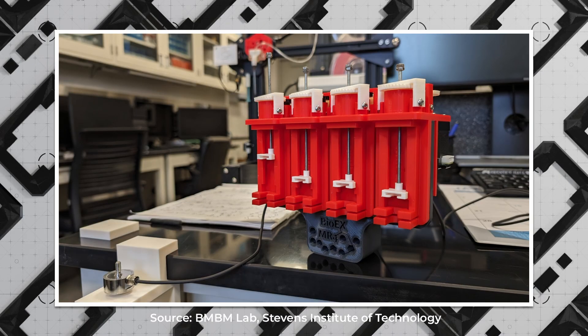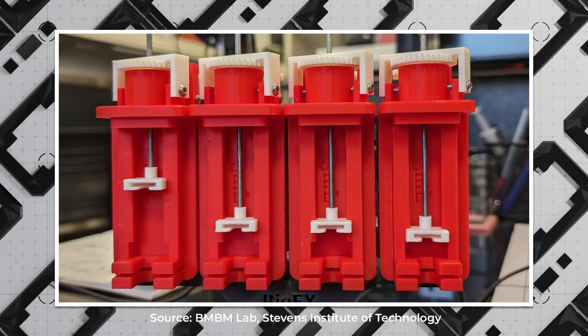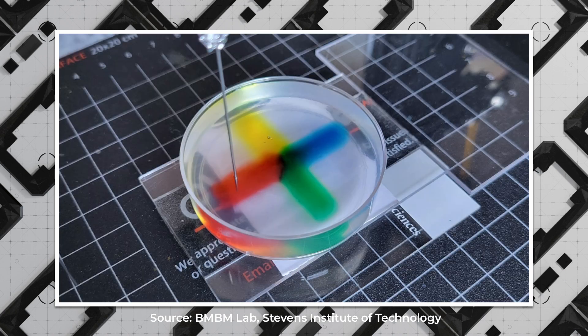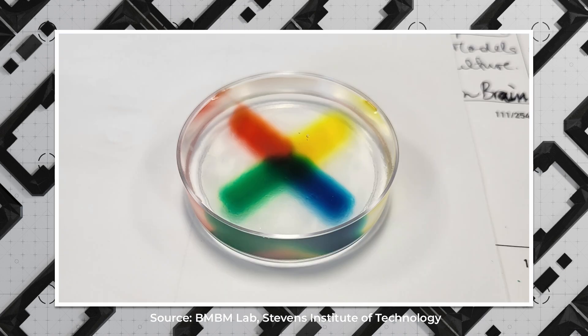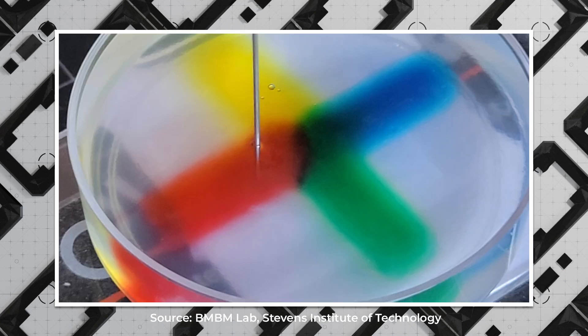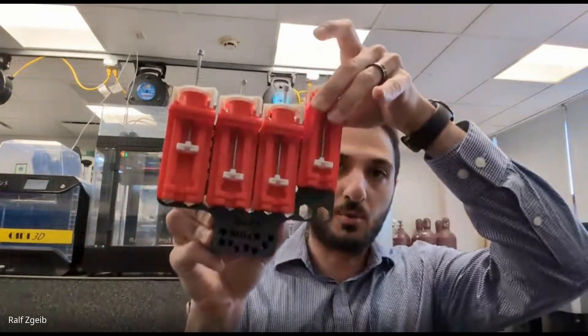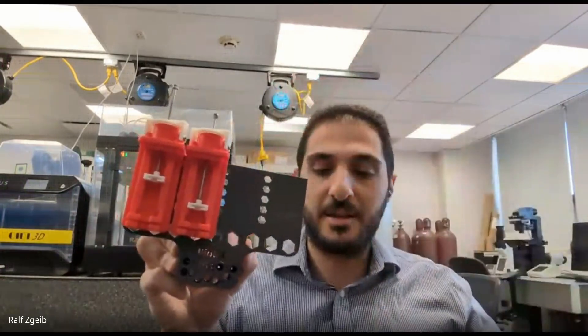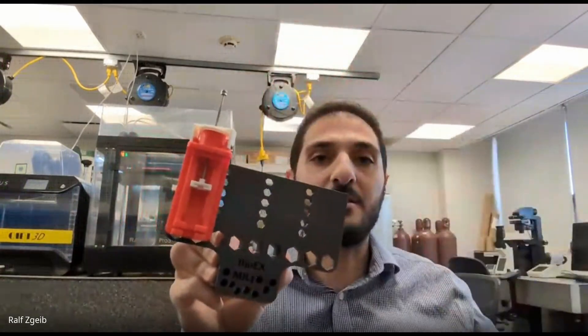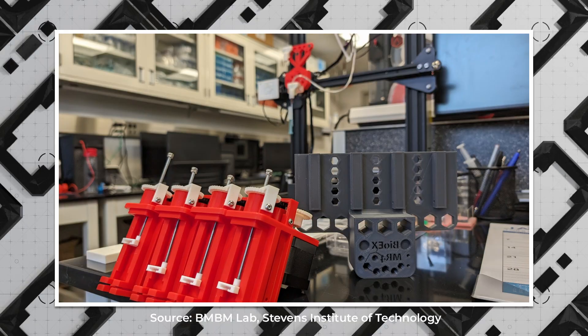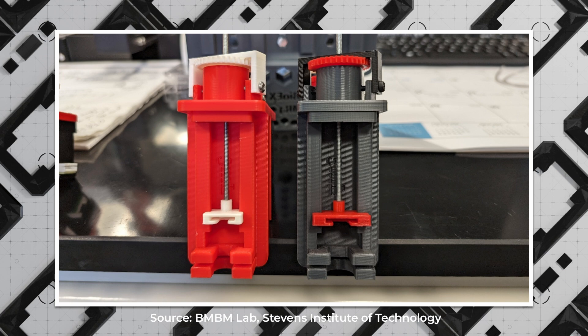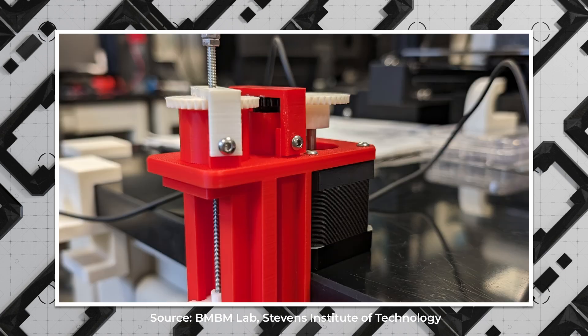We have 4 of them, so we can practically extrude 4 materials in the same print. Imagine you have an organ with multiple cell types, so we can print them all in a single print. Extrusion nozzles are also swappable, so we can remove them and exchange them with different sizes and different configurations. We're basically 3D printing bioprinters, completely designed and modeled by me.